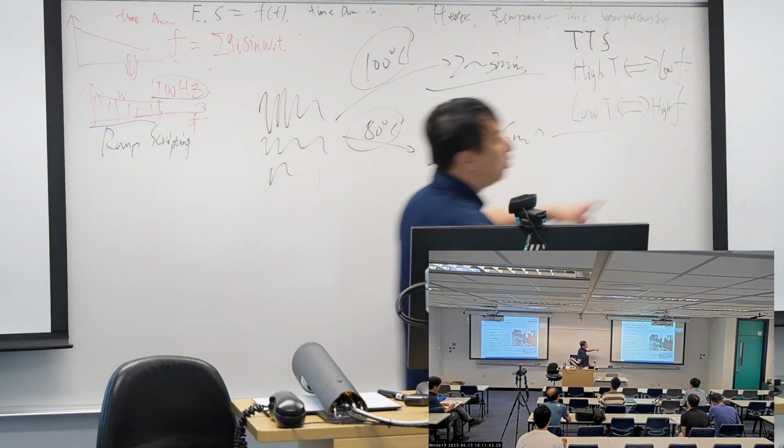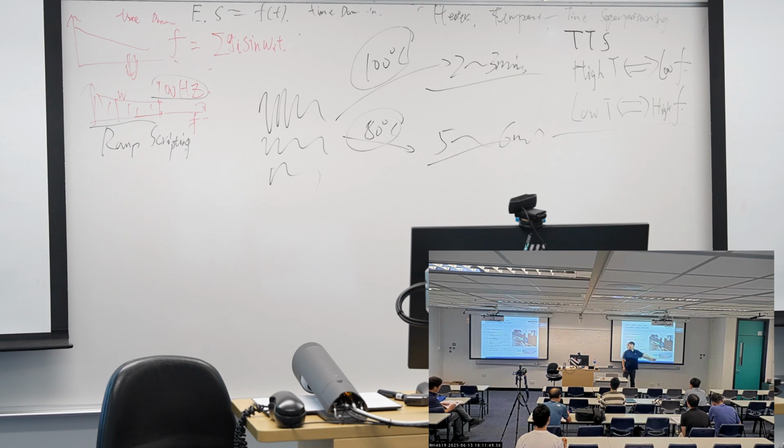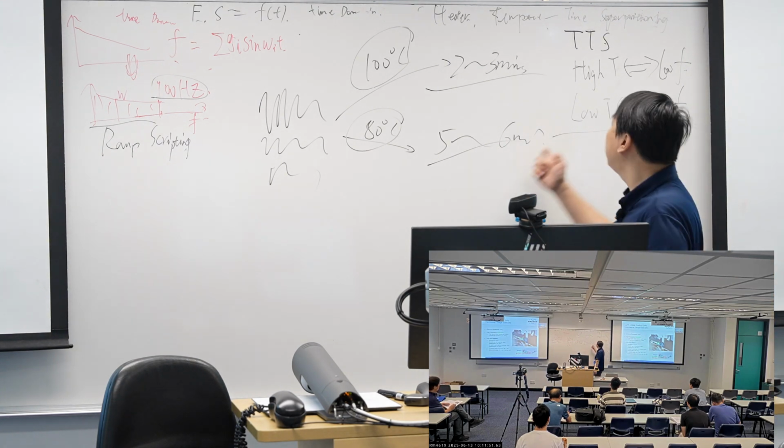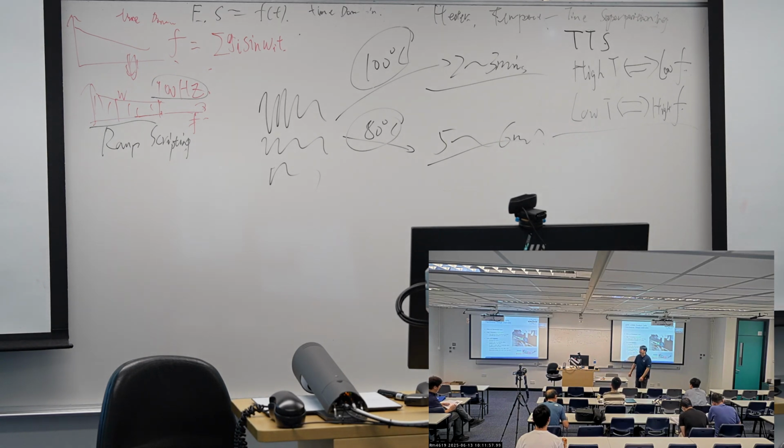I do not introduce a chiller, but I introduce a high frequency stuff. And then from the high frequency stuff, I can get the property at a low T.